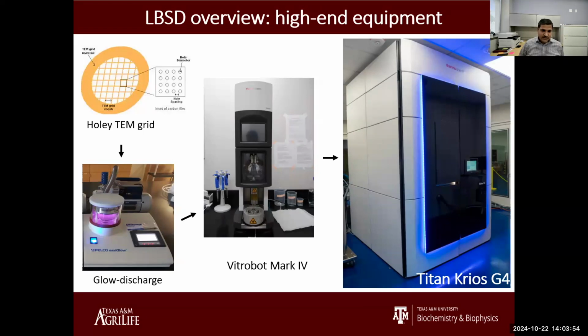First, the overview of the LBSD. Here I'm showing the different equipment available at the LBSD. On the left is the glow discharge.